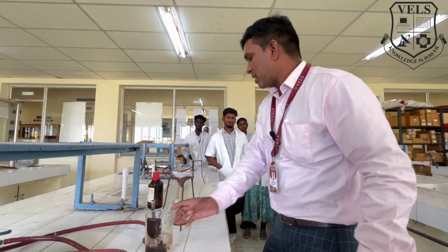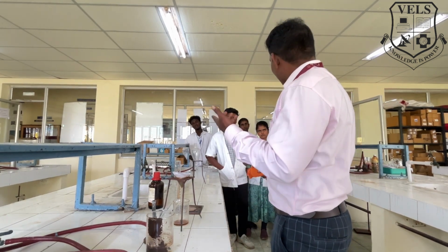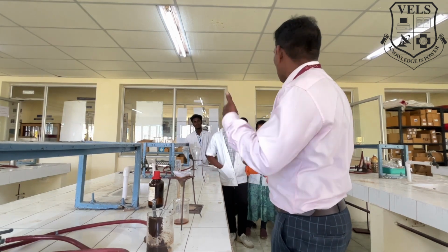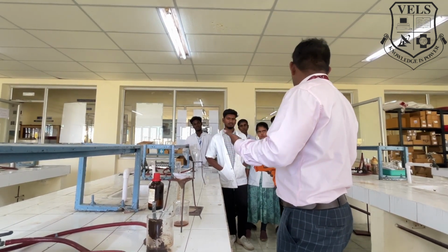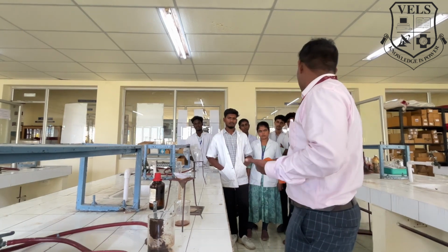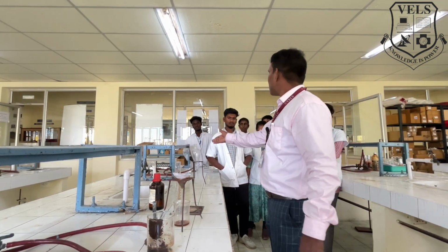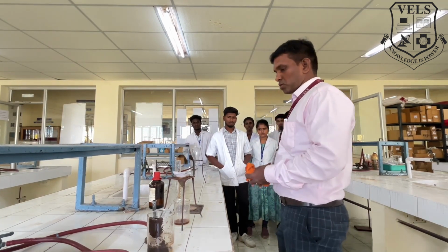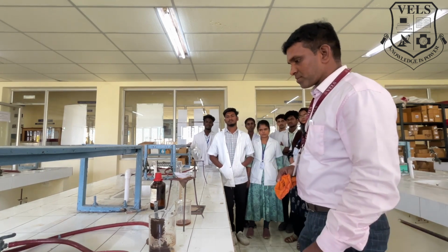The main idea of the separation is that this extract contains both tannin and caffeine, but tannin is insoluble in chloroform, while caffeine is soluble in chloroform. After this filtration, take the extract and do the solvent extraction process. We will wait for another 2 minutes for this separation process.